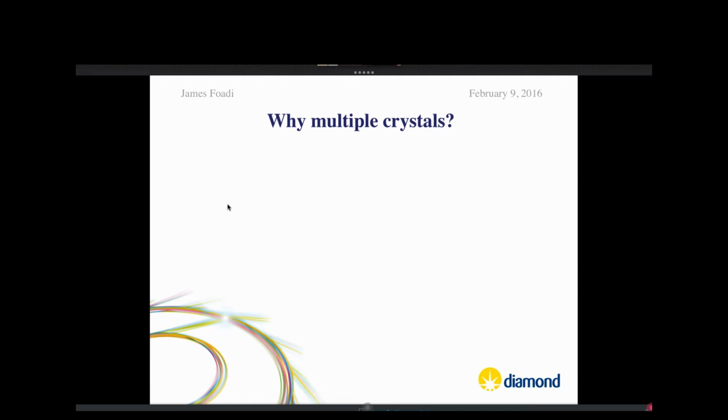So these days, it's much more common to grow crystals that are prone to degradation during data collection. Crystal size is also in general an issue. Small size means weak intensities, and at third generation synchrotrons, beam size can be matched to crystal volume, and the beam flux is very high. So moderate reflection intensities can be collected also from small crystals, but of course, crystals will degrade even faster with such intense beams. Therefore, in general, radiation damage means that crystals die before a complete dataset can be collected.